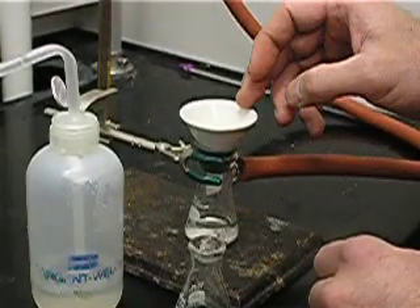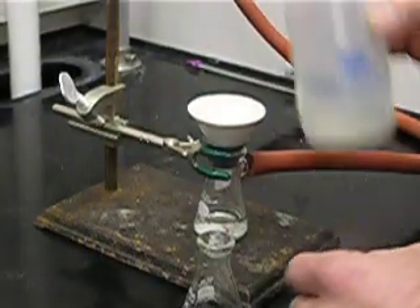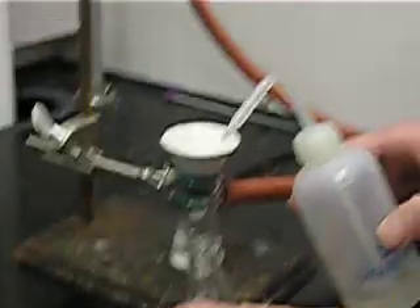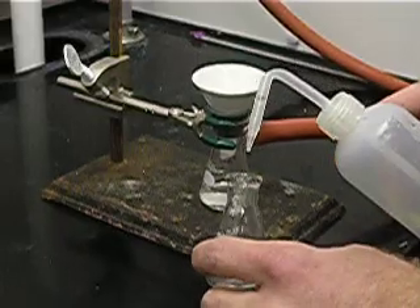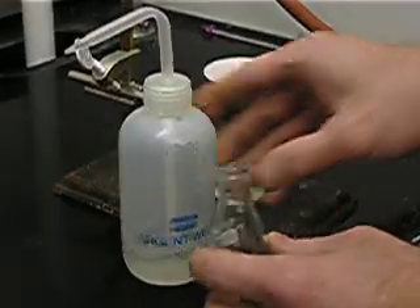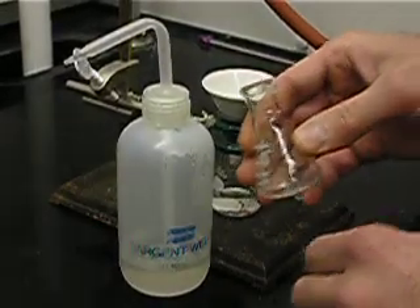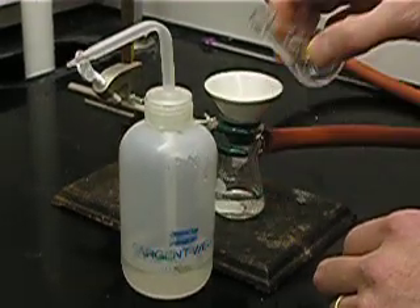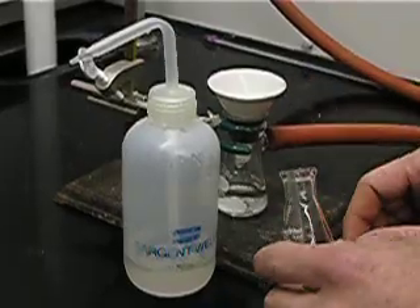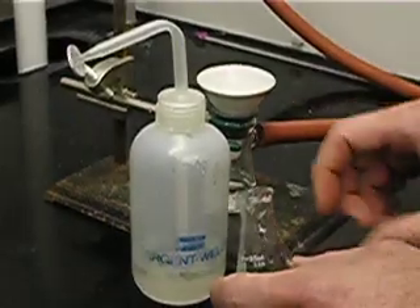We can see that water is being brought through the filter paper by the vacuum, and we have a solid being collected on the filter paper. An important part of vacuum filtration is washing of the solid to remove any impurities or solvents. Using just one to two mils of water, we wash the container that had the original suspension, stir or agitate, and pour that through the Hirsch funnel. The important point is to use many small washes, not a few large washes.